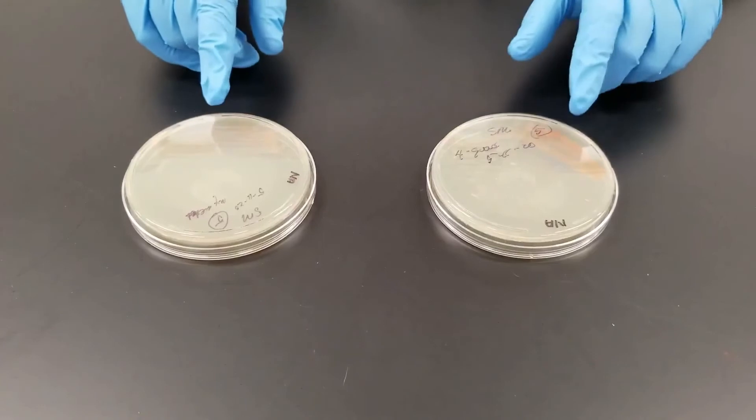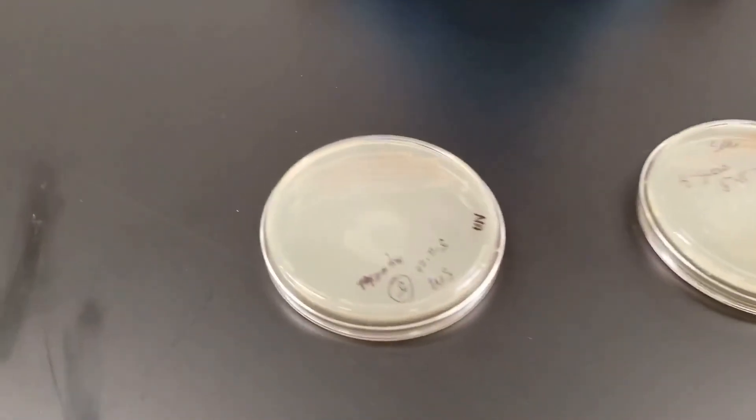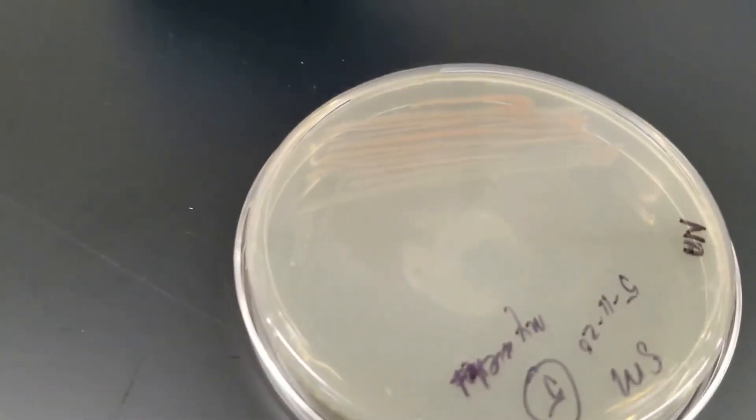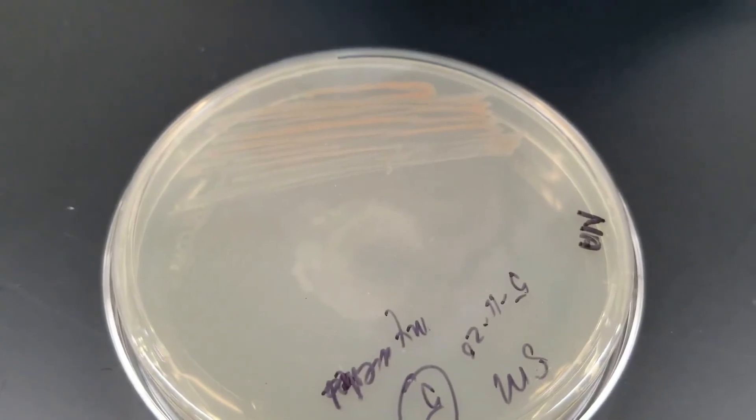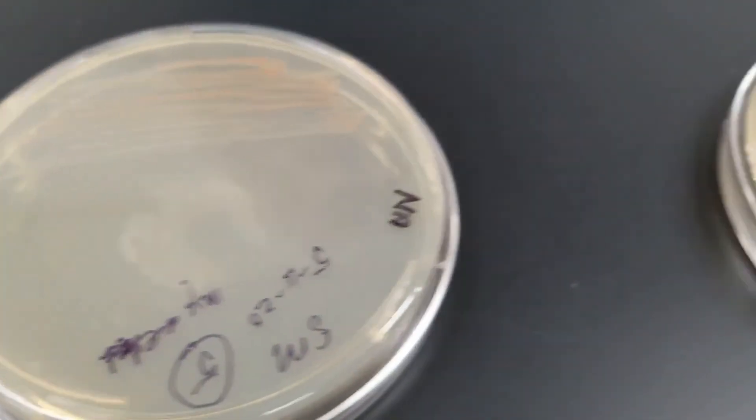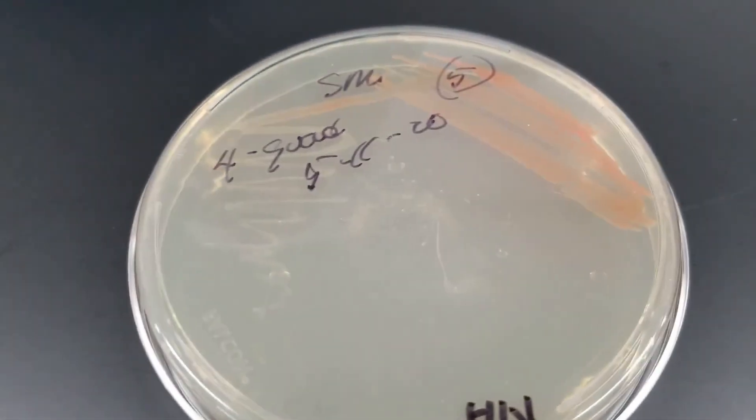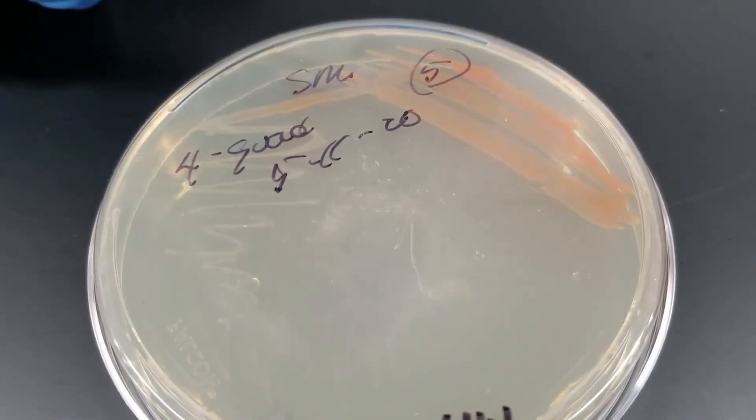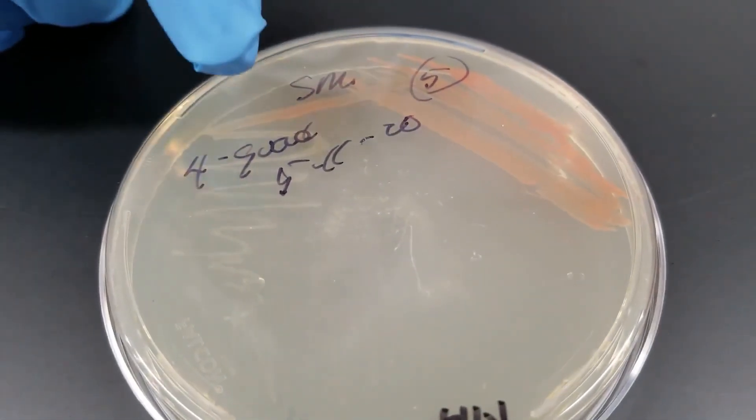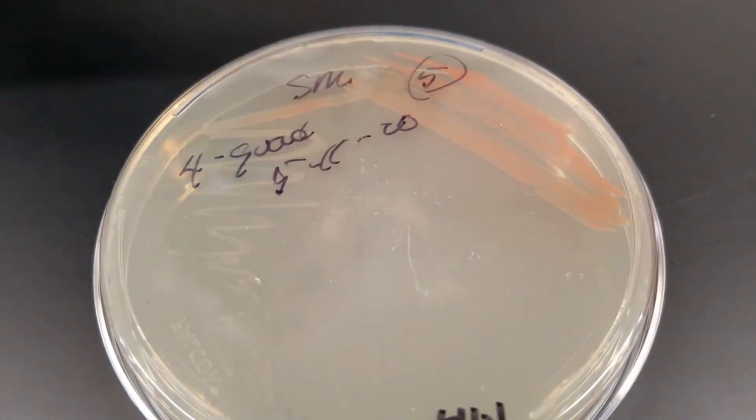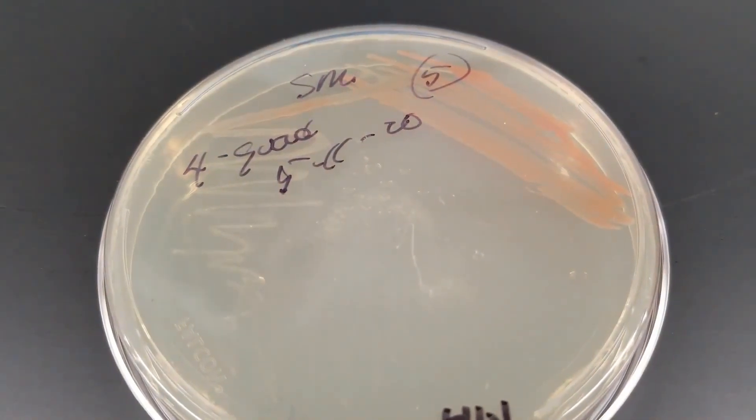On both of these plates, you can see where initially, where we started the streak, you have very heavy growth in here, and then the idea is you are spreading it out, you're diluting it out. And so as you follow the streak down, towards the end then is where we have individual colonies.